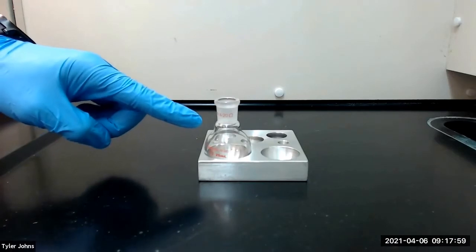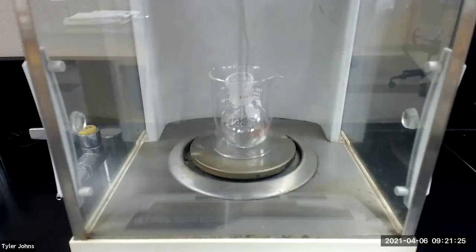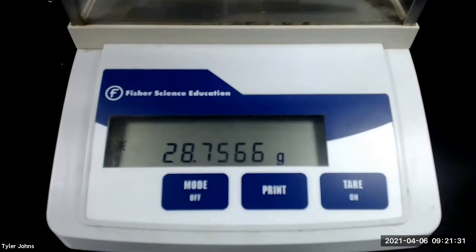Let's get started. We will begin by pre-weighing a 25-milliliter round bottom flask. The mass of the pre-weighed 25-milliliter round bottom flask is 28.7566 grams.